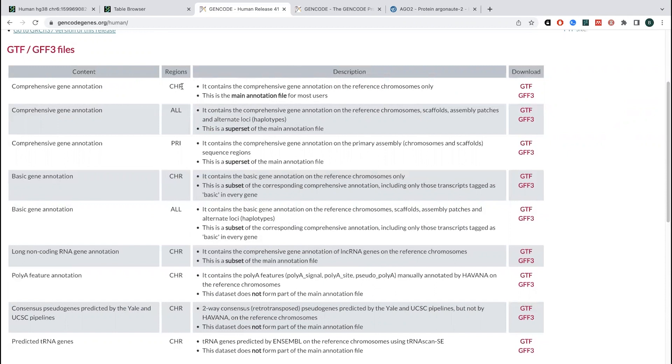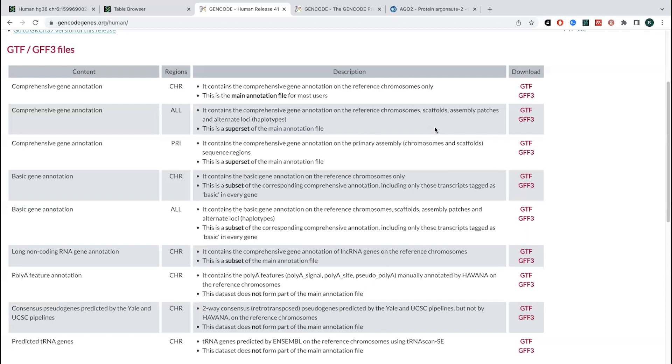And you can see there's a CHR in this all. So things that are on reference chromosomes. So these are the normal stuff, but then there's also stuff that hasn't really been mapped to the genome completely or various alternative things. So basically if you have this comprehensive gene annotation where you have the chromosomes as well as the scaffolds, and things like that.